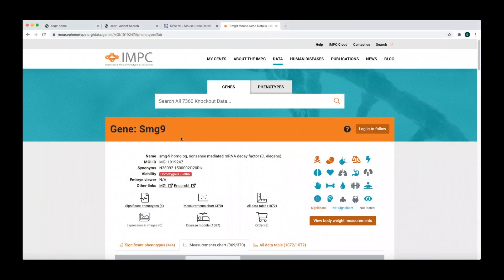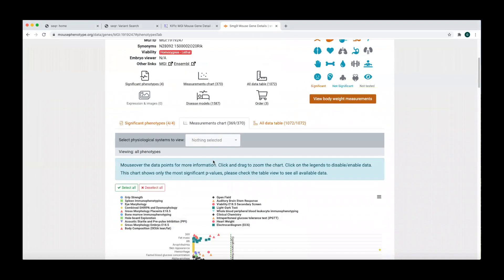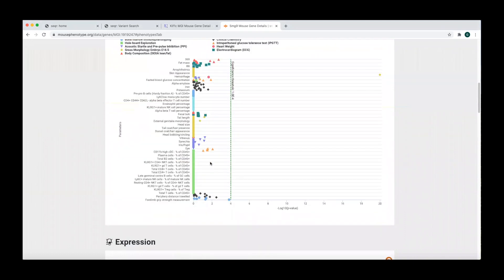The IMPC website presents a phenotype graph that can be seen by clicking on the measurement chart tab.